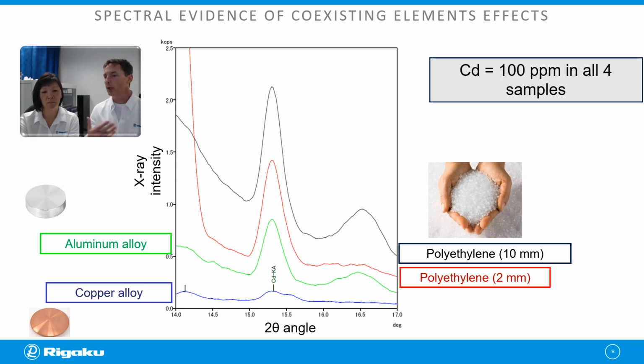And if we incorporate those elements into our calibration, you can make a fairly universal calibration to cover so many different types of formulations. Right, so the key here is to describe your entire matrix. If your excipients are changing or there are heavier elements in there versus just cellulose or lactose, it is changing. You have to account for the entire thing because you're not extracting it out. We are analyzing it as a bulk.